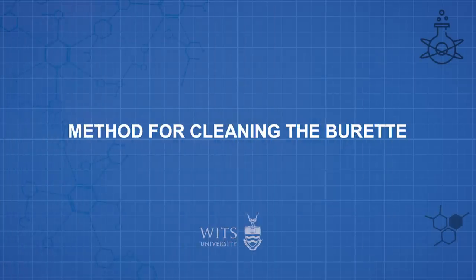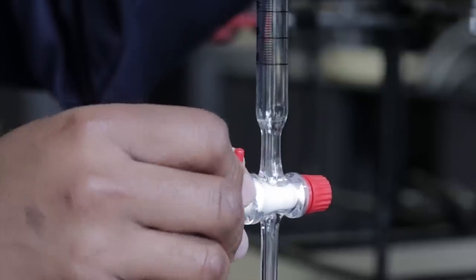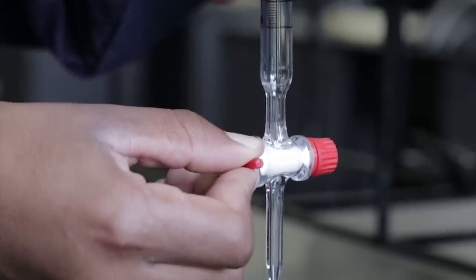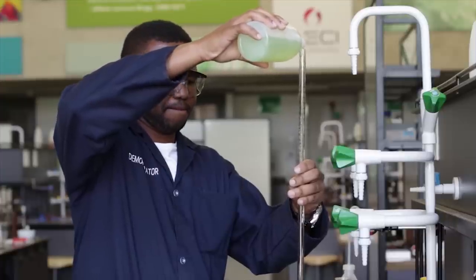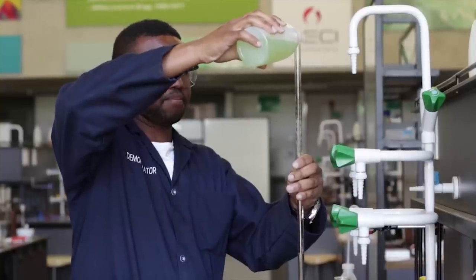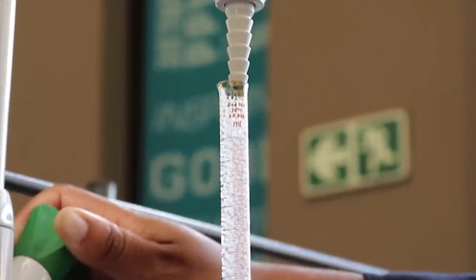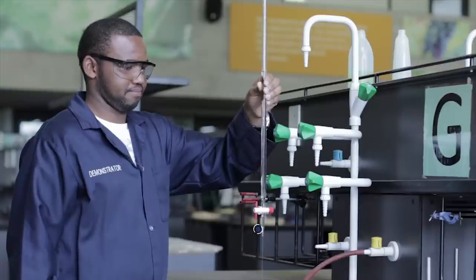Method for cleaning the burette: The 50ml burette that is found in your locker is cleaned by adding approximately 20ml of cleaning solution or detergent that is found in your bench, while making sure that the burette's tap is closed. The burette is then filled with tap water and then the burette tap is opened to allow some of the solution to run into the tap.